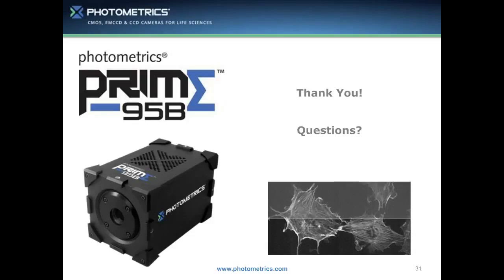How does the 95B compare with the OrcaFlash 4.0 in terms of, first, absolute imaging area, second, maximum frame rate, and third, sensitivity at low light levels? You want me to separate that out. So, first, in terms of absolute imaging area, it is effectively the same. I believe the 2K by 2K CMOS sensor has a diagonal of about 18.7 millimeters. The Prime 95B sensor has a diagonal of 18.66, effectively the same. So you get the same field of view out of the sensor.